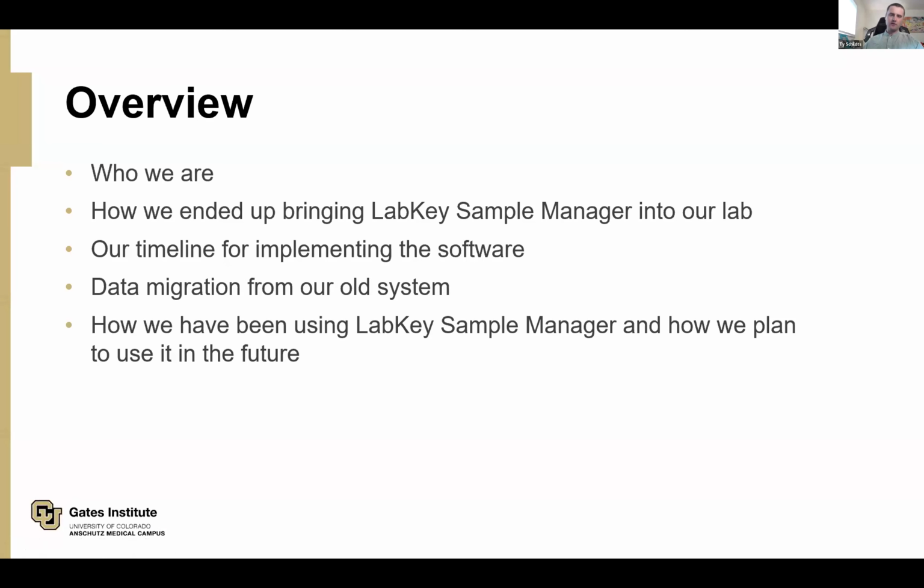So just a quick overview of this presentation. I'll go over who we are, how we ended up bringing LabKey to our lab, the timeline we were up against, and what that data migration looked like. We had a rather robust data backup that we had to move into this new LabKey structure that we set up.